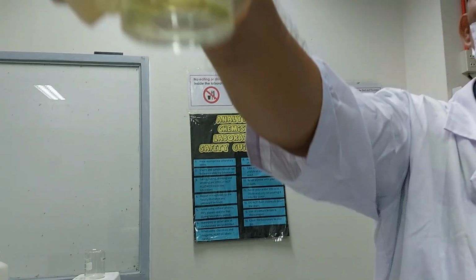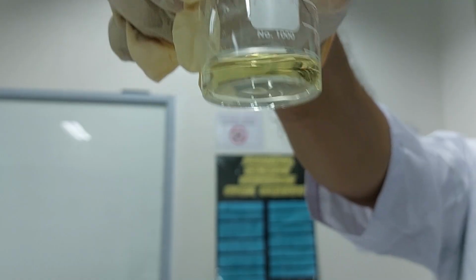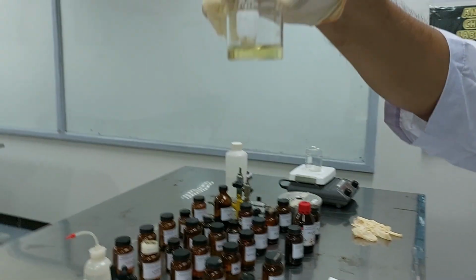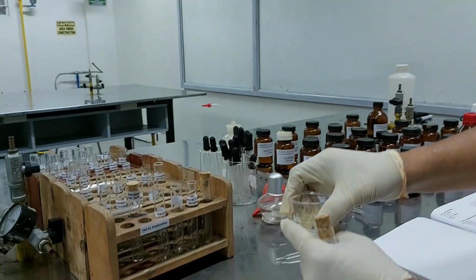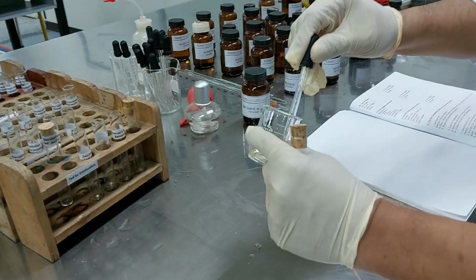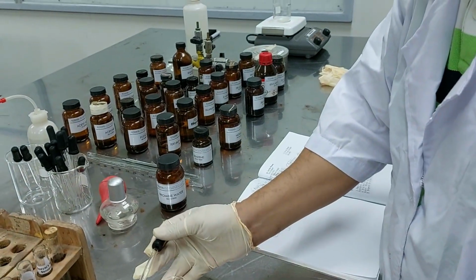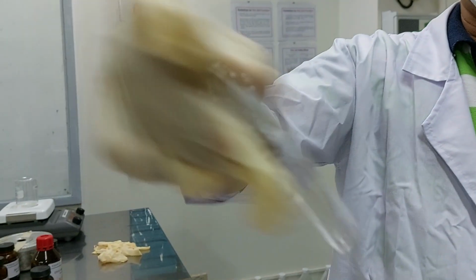You notice the color of bromine, it's yellow. Supposedly it's yellow orange, but you have a very low concentration of bromine. So let's see if this will turn colorless after the reaction with acetylene. Okay, let's check.